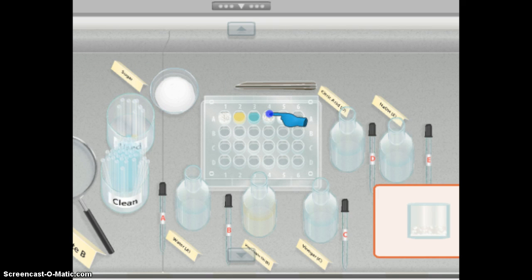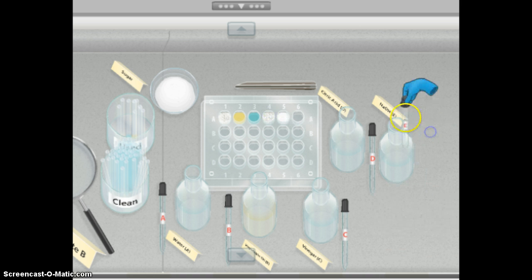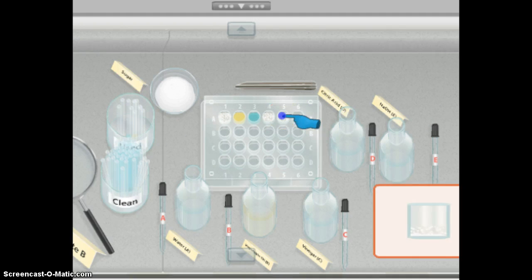And go ahead and write down your observations for citric acid and sugar. And then last, we have sodium hydroxide. So hopefully you've heard me say sodium hydroxide enough that you'll remember NaOH is sodium hydroxide. Na is sodium, OH together is called hydroxide. And that's something we'll be talking about in the unit with bases and acids, as well as when we make chemical equations. All right, so go ahead and write down your observations for that one as well.